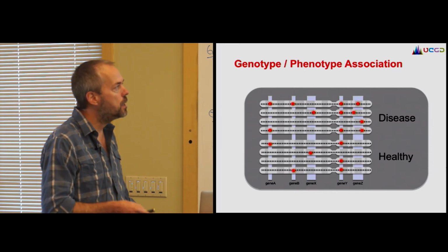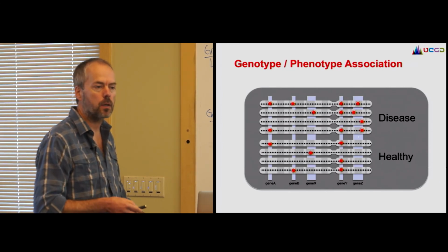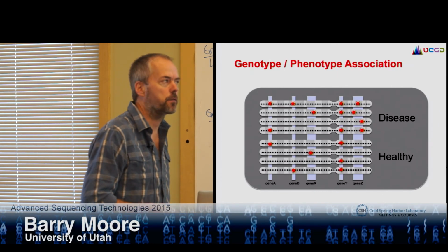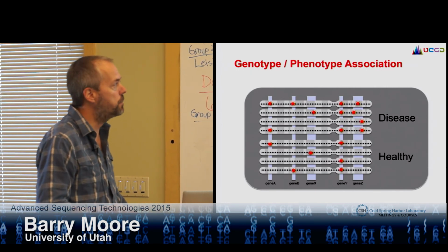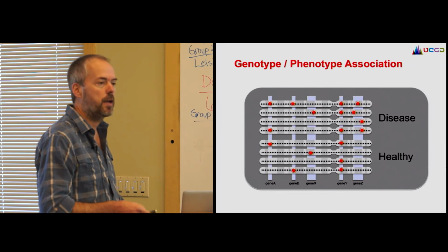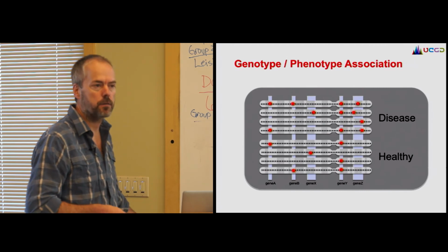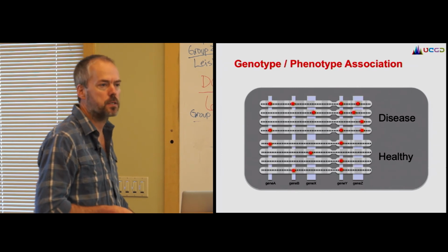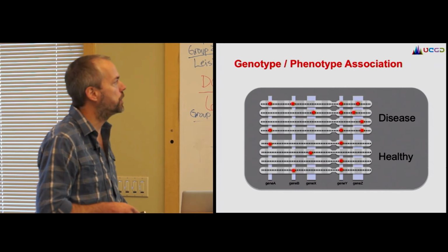One thing to do is to not just consider each variant individually, but to aggregate the burden of those variants, including the rare variants or the common ones, to the gene level. And we get a couple of nice features out of that. First of all, now we can consider all of these variants in these individuals together, even though they're not the same variant. And second, when we're doing lots of tests across the genome, instead of having to test every variant site and consider that an independent statistical test, which we then have to correct for that multiple testing problem at the end, we're now capped at the number of genes that we're testing genome-wide, which is fairly fixed and much smaller than the number of variants genome-wide.